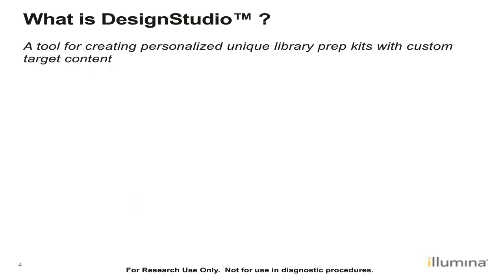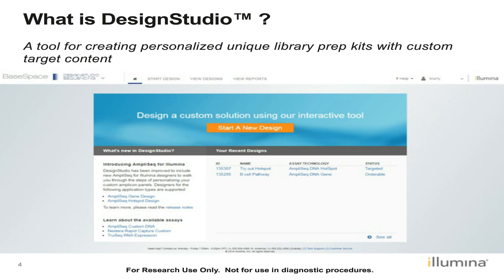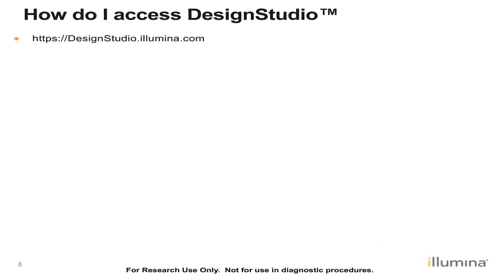Design Studio is a tool on the Illumina website that is meant to create personalized, unique library prep kits with custom, targeted content. The first option to access it is to go directly to designstudio.illumina.com. Please note that to log in to Design Studio or create any new custom design, you will need to sign in with your My Illumina account. This is free to use, but you need to have a My Illumina account. If you have any issue with that, please call us.